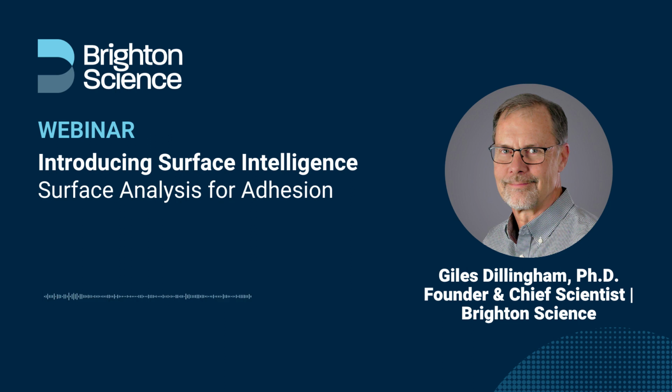Contact angle measurements are good for molecular level stuff. X-ray photoelectron spectroscopy is good for molecular level stuff, right? X-ray photoelectron spectroscopy is an extremely powerful reference surface analysis technique that we like to use for process development and process troubleshooting. It's really not deployable as a routine quality assurance measure, right?